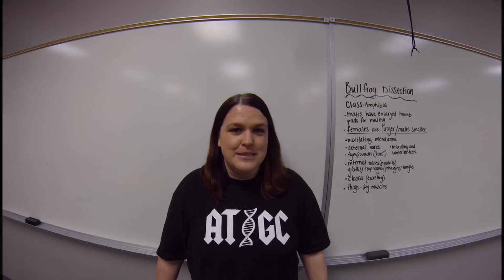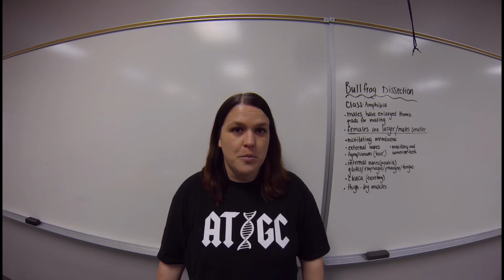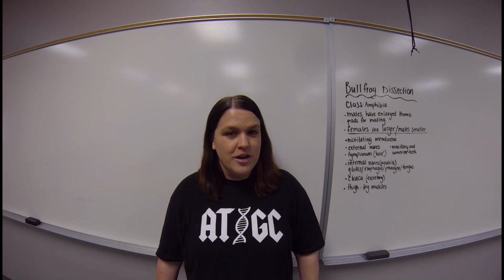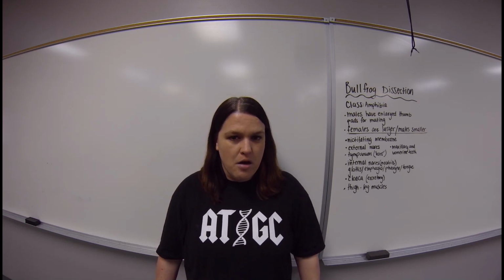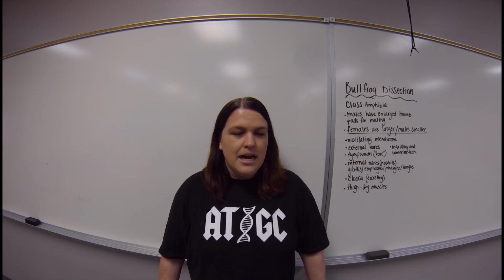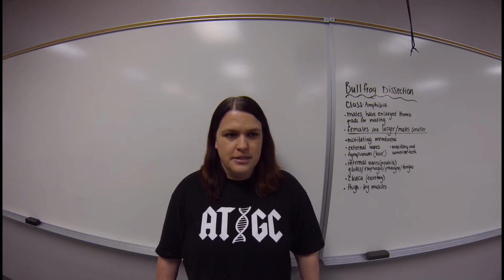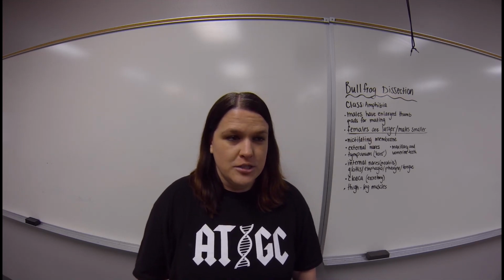Alright guys, this is the one you've all been waiting for. This is your introduction to the bullfrog dissection. So as you know, bullfrogs are very complicated, and so we're going to read a little bit about what you're going to see, what their purpose is, how they reproduce, things like that. So hang with me because there's a lot of information to cover.